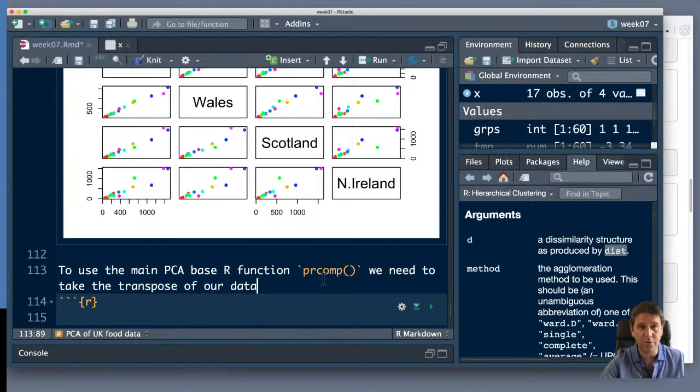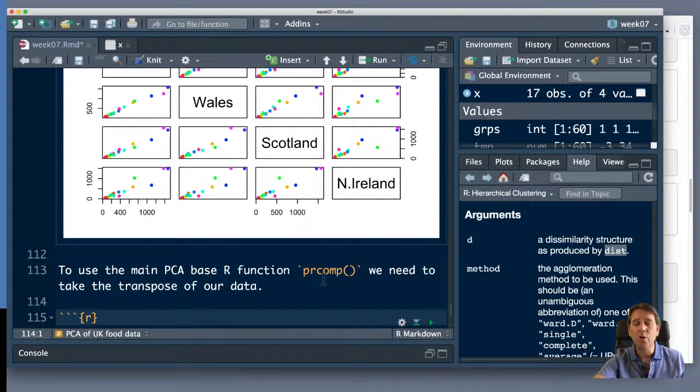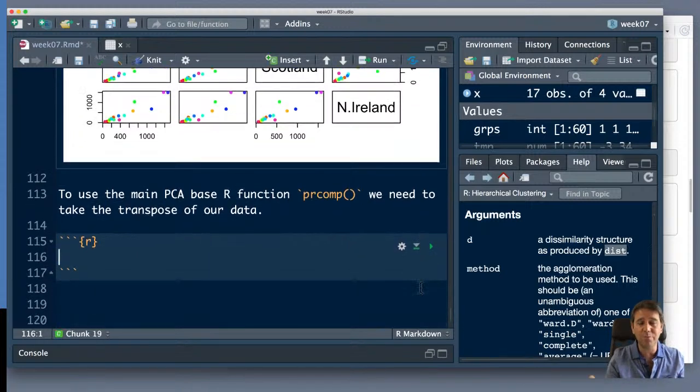We'll take our data just like we have it here, or as we'll see with our RNA-seq data in a little bit, where we have our genes in the rows. Here the foodstuffs are in the rows, the things that we're actually measuring, and then the conditions, like drug treated or wild type and knockout, are down the columns. But this base R function actually expects it the other way around. It wants the transpose of that. So we're just going to have to play along with it. We read the help page and figure out that that's what it wants as input.